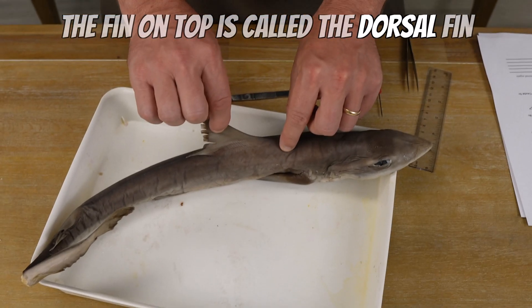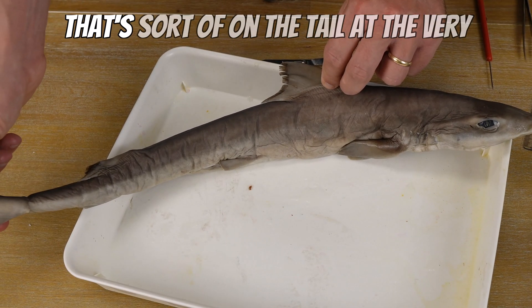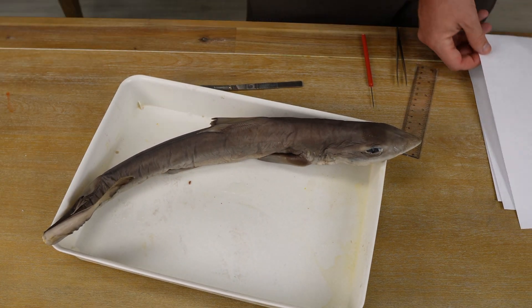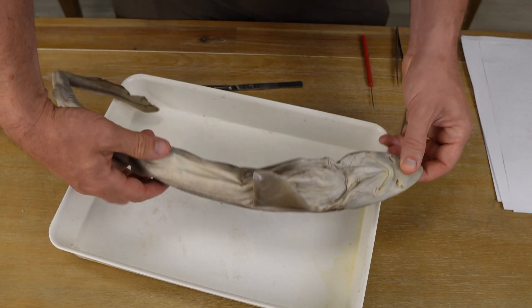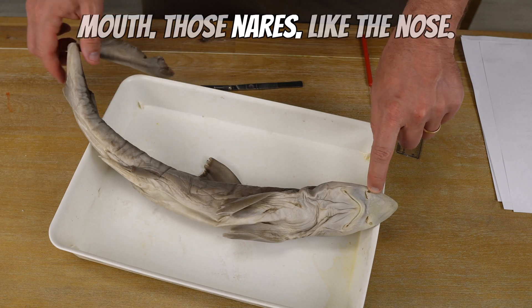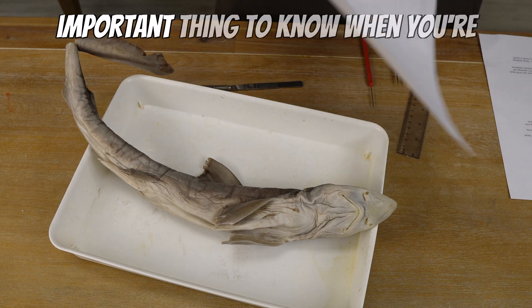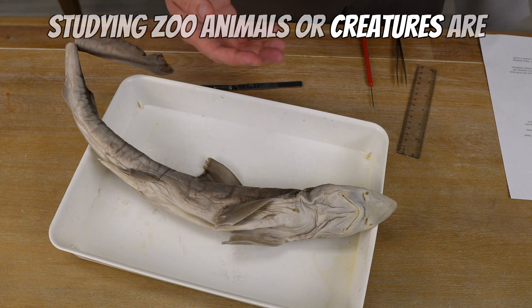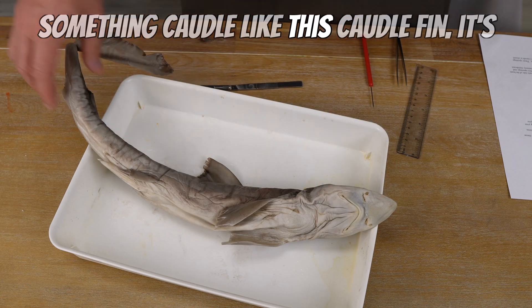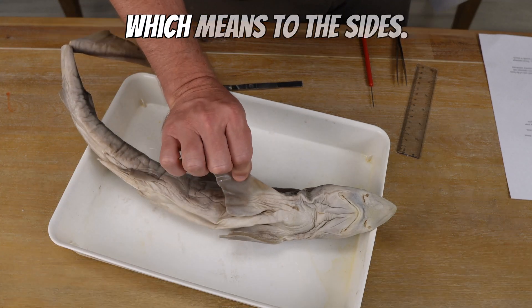The fin on top is called the dorsal fin, and it has two of them — one here and one on the back. At the very back, we've got something called a caudal fin, which is on the tail. Let's flip this shark over and look at the underside. We've got some pectoral fins here on the sides, the mouth, and the nares. We also have some fins back here called clasper fins. It's important to know directional terms: cranial means closer to the head; caudal, like the caudal fin, means towards the tail; medial means middle; and lateral means to the sides.